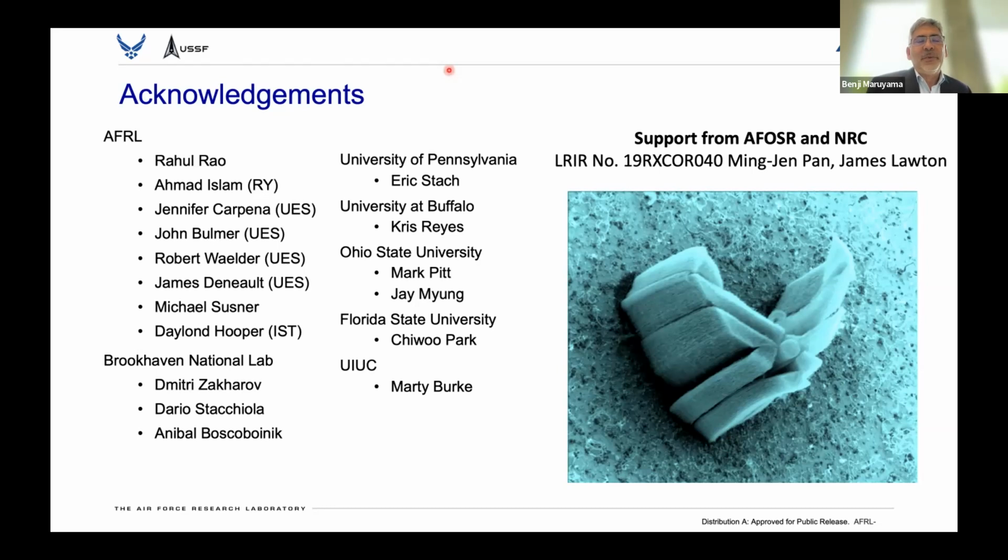Having done some beamline experiments, you go up with your plan A, B, C, D, and probably A, B, C are gone by lunchtime, and you're left with D, and then you have to figure it out for E, F, and G. But you're making decisions on the fly, right? And so what if you then had a robot that could help you explore that complex decision space autonomously and do experiments faster, more efficiently, and in high dimensions to essentially maximize the use of precious beam time?